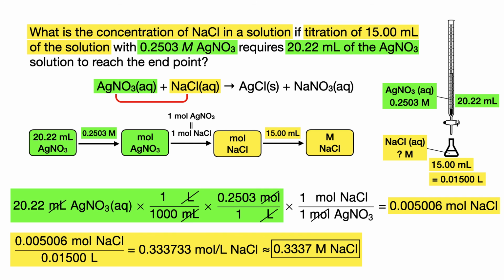Okay, so titrations are a very widely used technique. There are other techniques out there that are faster and easier for measuring amounts of substance, but one of the nice things about titrations is that they are very, very precise. You can see from this example that we're able to get out 4 significant figures of precision from a titration. And so anytime you want to determine the amount of a substance with high precision, titration is a great technique to use.